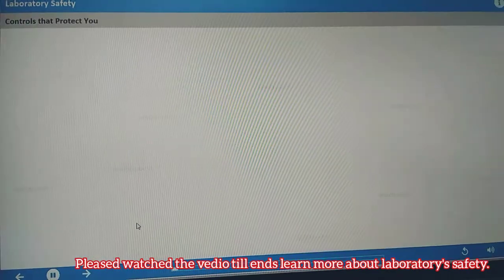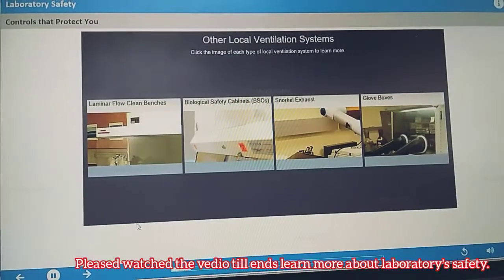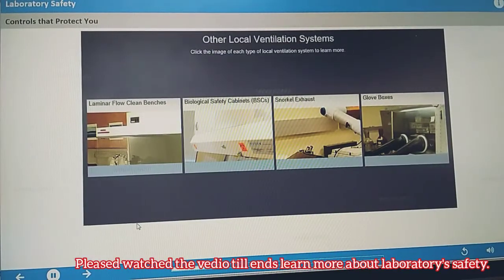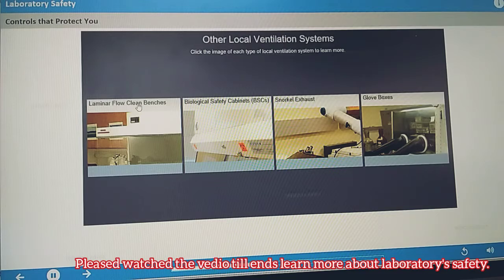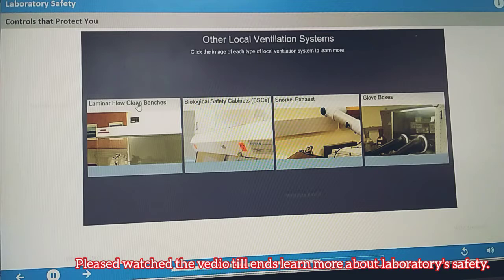Other local ventilation devices are designed to protect you, the product, or the environment. Exhaust from these systems should pass through scrubbers or some other treatment before being released into the general exhaust system.